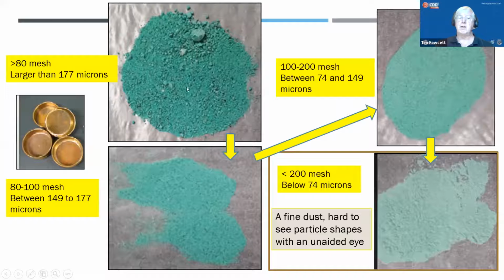Now here's a sieve study where we actually took it through a series of size sieves to get down to our fine powder. But there's something important that I wanted to point out in this particular set of sieves. When you're at a larger size, like a couple of 100 microns or so, you usually can see the individual particles with your eye. And you can see colors by your eye. And that's very useful. It'll tell you that there's at least 3 phases here.